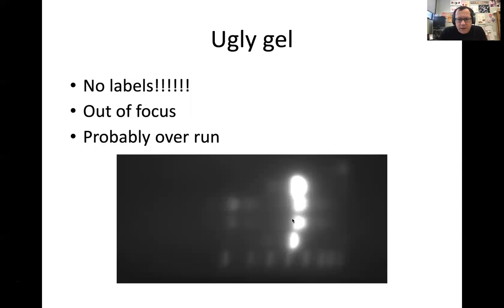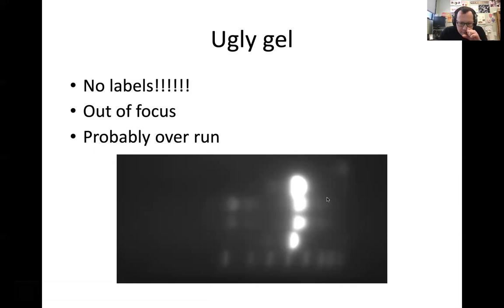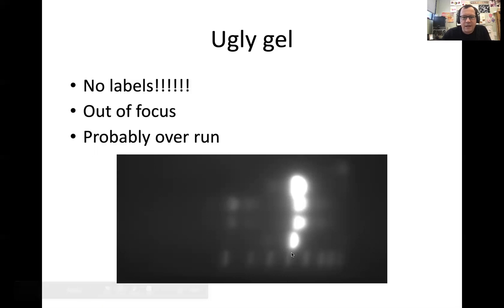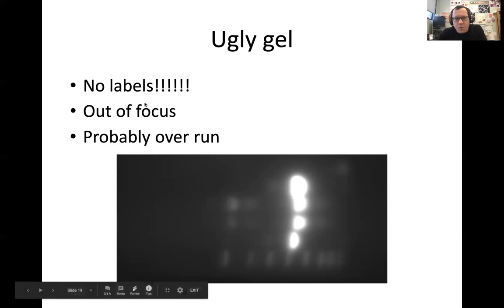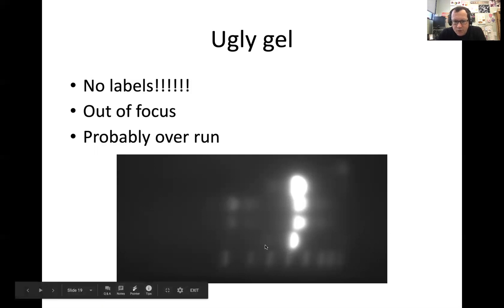So when you run your gel, our new gel apparatus doesn't have to worry about focusing, it auto does it, but you want to think about how your gels look. And you never want to turn in a gel that looks like this, really. One of the things is that there's no labels on it. You always want to label what goes into each well.